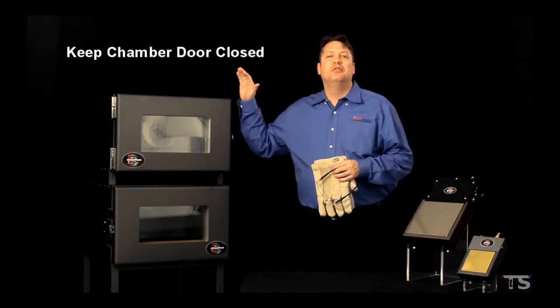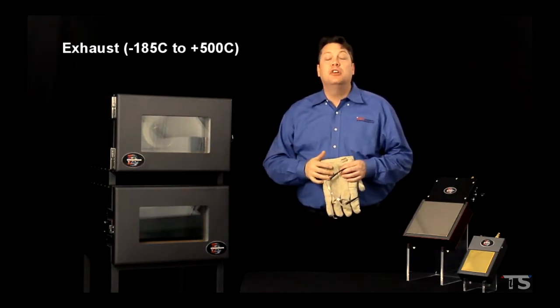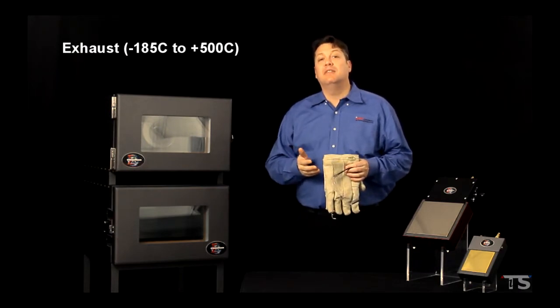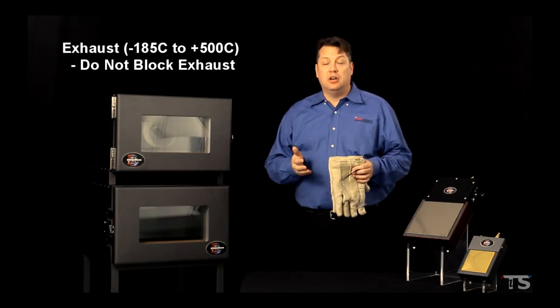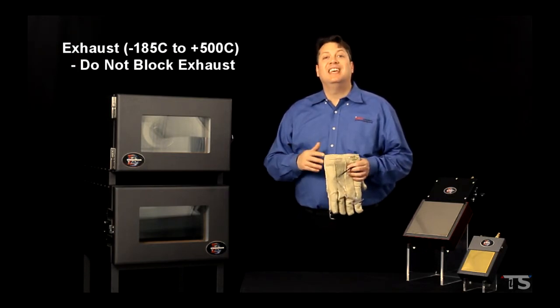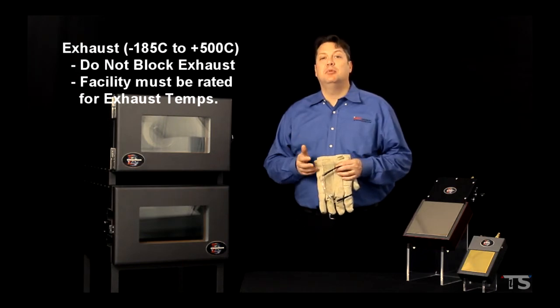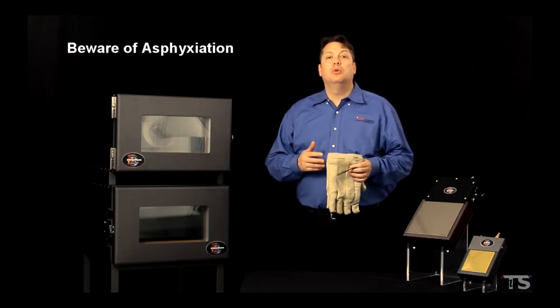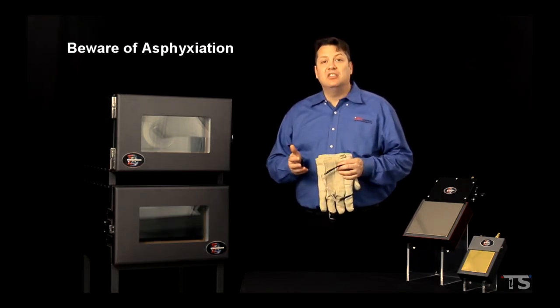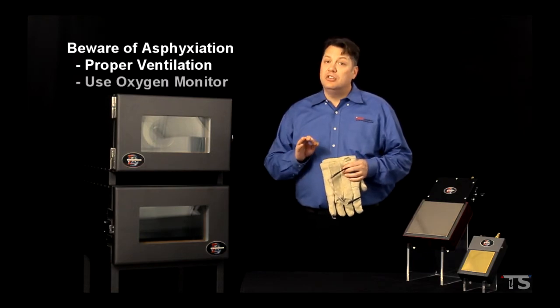Keep the chamber door closed whenever not at ambient temperatures. The exhaust temperatures in the chamber could be anywhere between minus 185 and 500 degrees Celsius. Because of this, please don't block the exhaust. Also, if you make any facility connections to the exhaust, the connections should be at the same temperature rating as the equipment. Be aware of asphyxiation hazards when working with cryogenic exhausts and gases. All rooms should be properly vented.